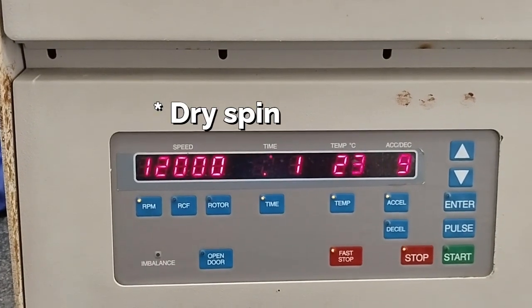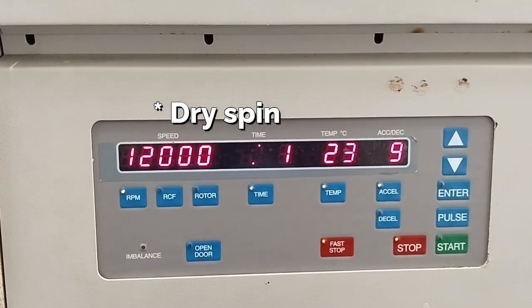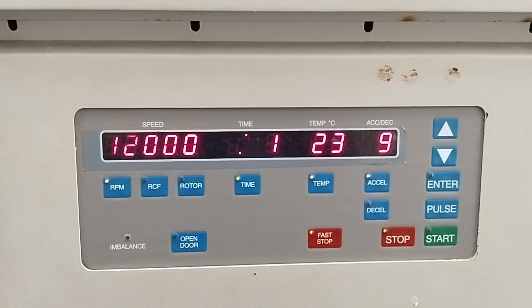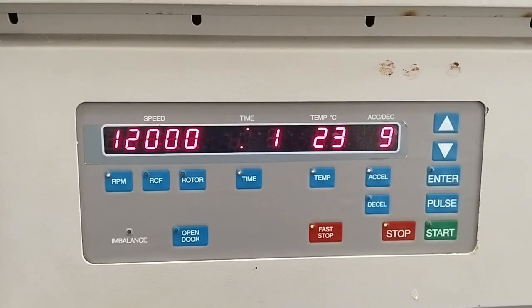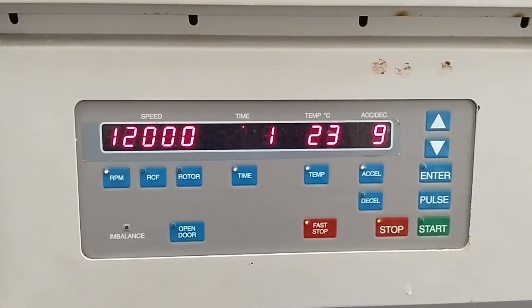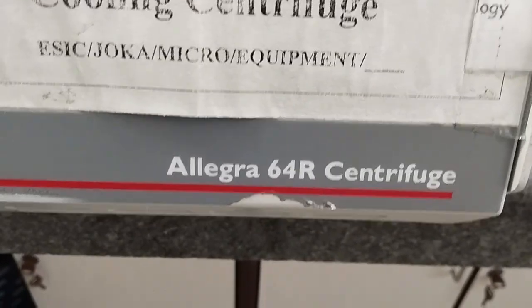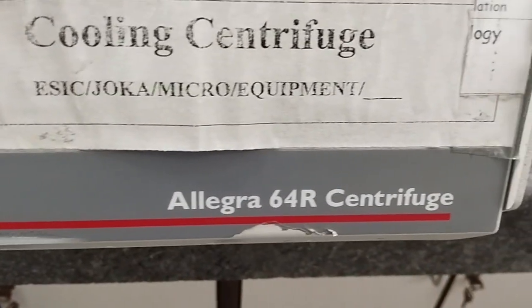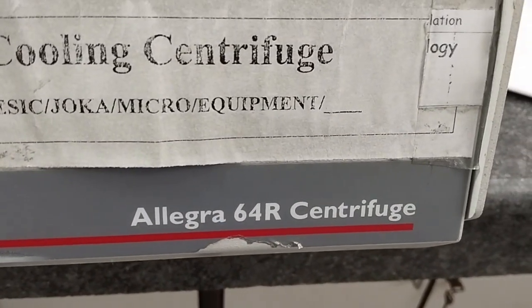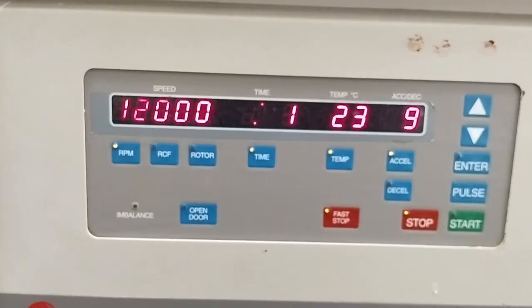Dry spin is going on at 12,000 rpm for 1 minute, and we are using a cooling centrifuge. The temperature is set at 23 degrees centigrade. This is the cooling centrifuge from Beckman Coulter, model Allegra 64R. It is a very good centrifuge, and it is very suitable for any kind of molecular diagnosis or extraction procedure.